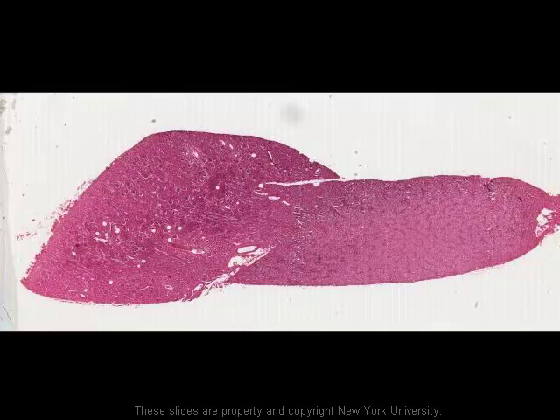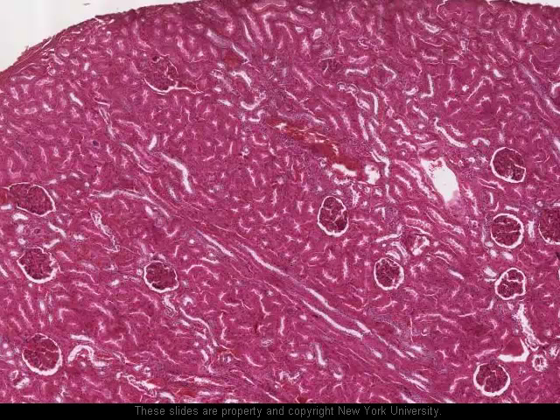So now let's move to the cortex out in this region out here and take a look at higher magnification at what we can see. Here we are looking at the cortex. The outer part of the cortex of the kidney should have a reasonably dense connective tissue capsule on it. We can see a little bit of the capsule just along here. The bulk of the cortex is made up of profiles of tubes, either proximal or distal convoluted tubules, and indeed some collecting ducts and loops of Henle. Embedded within that material are the very large glomeruli, the filtration structures of the kidney.